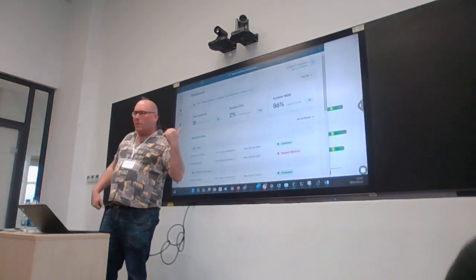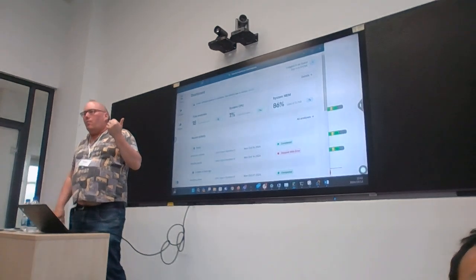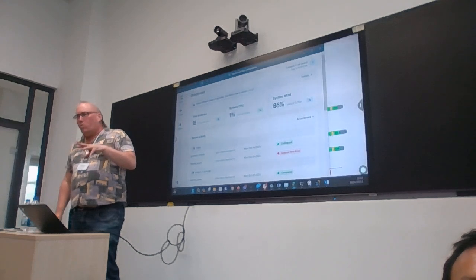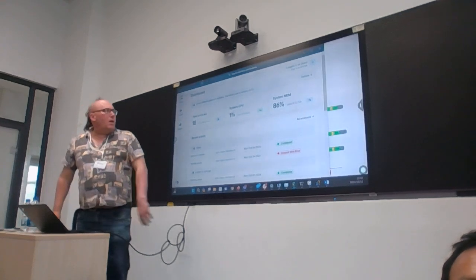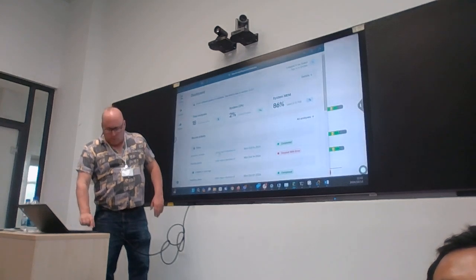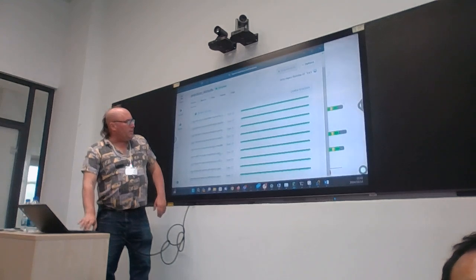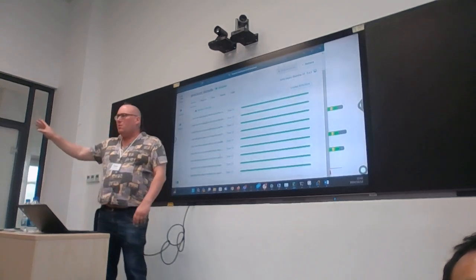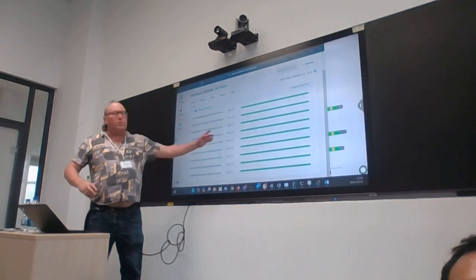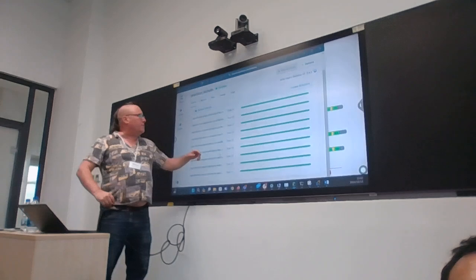Okay, and we know that not everybody's internet is great, so then we came up with this. This software is a bit more complicated to set up. Okay, it's from the Oxford Nanopore company, but it has the advantage that it runs the pipelines on your computer. Okay, and if we look at this, what it runs, I'm just going to look into one of the runs that I had earlier. Okay, then it runs all these different tasks. Now, because of the way that it's formatted, you can't read it very nicely. You can see more detail in the logs, which I'll show later.